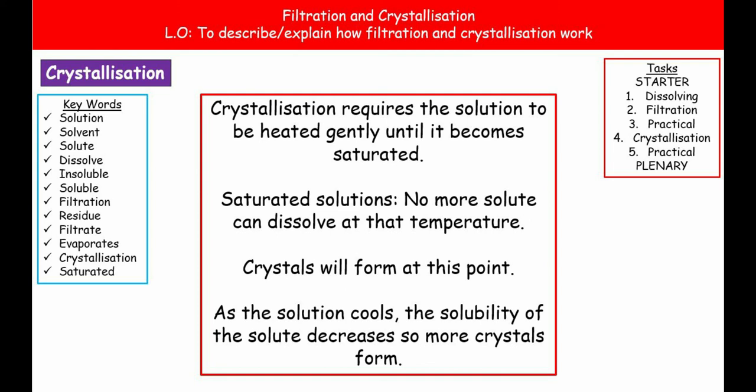If you do this in school, and some of you like to just put your evaporating basins on top of the Bunsen burner and then heat it, particularly when you're getting copper sulfate crystals, then what we find is it suddenly starts spitting and we make these teeny tiny little crystals that end up everywhere. So by placing it over the beaker of water, it's a gentle process.